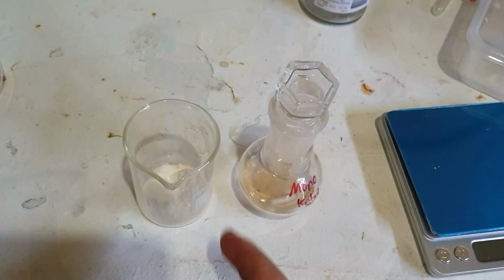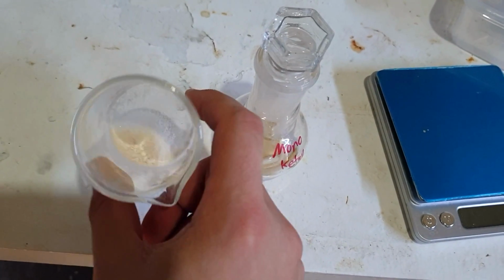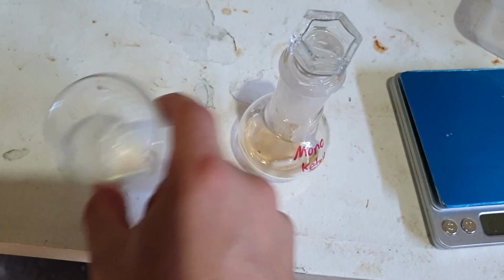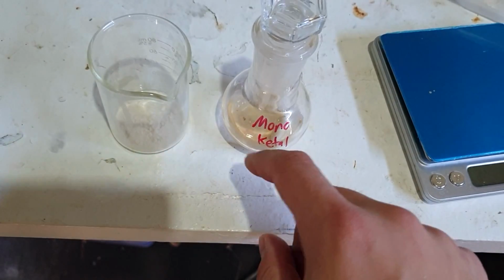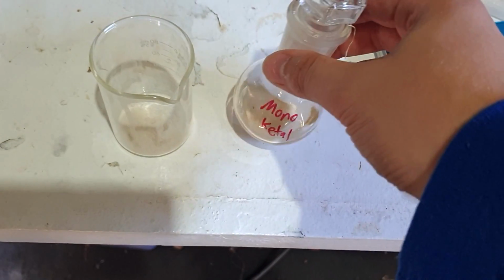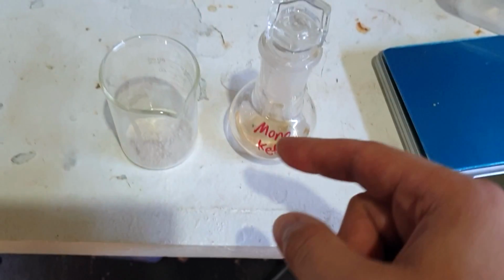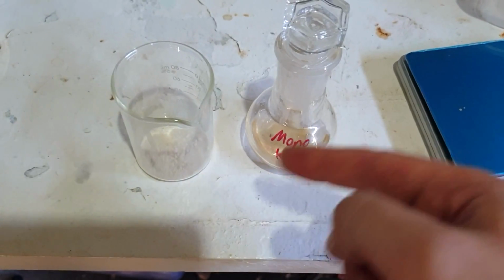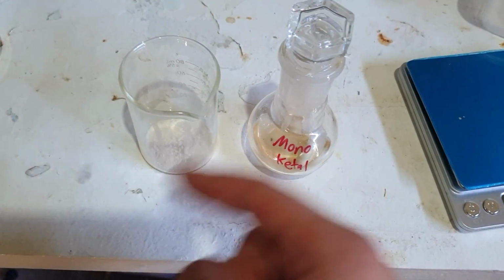After drying off that acetone, we're left with exactly 1 gram of pretty pure monoketal. Well, I believe it's pretty pure monoketal. Everything else that didn't crystallize out from that reaction mix, I've kept, which will be a mix of the monoketal and the diketal, I reckon. And we'll just use this when we run the reaction again, because I still have some starting material, the diketal, to put in to make more monoketal, because we'll need more than 1 gram going forward.